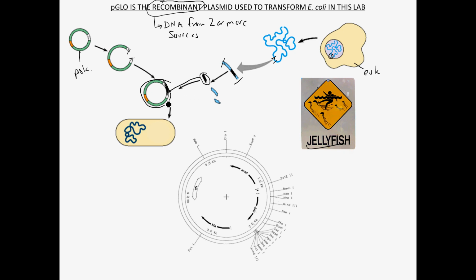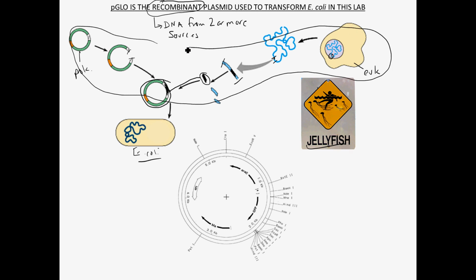Then we're going to use this recombinant plasmid to hopefully put into the E. coli, right, to transform the E. coli. All the stuff that I'm describing right here has already been done. We're not doing this in our lab. I bought the kit, I bought the plasmid already transformed. You could also buy a kit that actually does the splicing here, cuts this open and cuts out this gene over here and puts it in, everything like that, but that's time consuming. And so I just cheated a little bit there and bought the plasmid already recombinant.